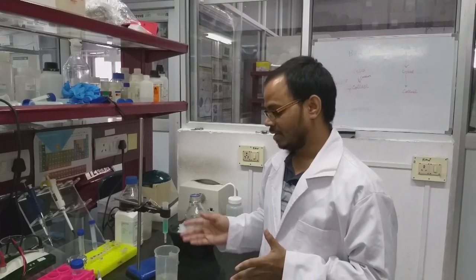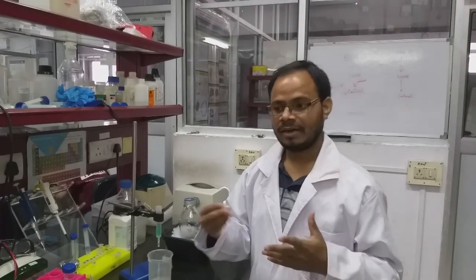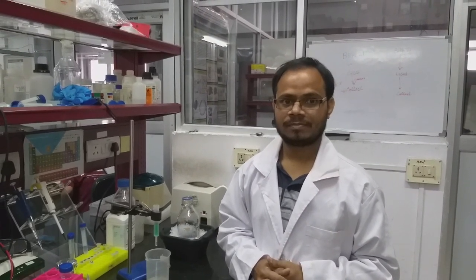So we will keep in this condition at least 20 minutes to charge the beads. After that we will remove the nickel NTA, we will elute the nickel solution and then equilibrate with the lysis buffer.